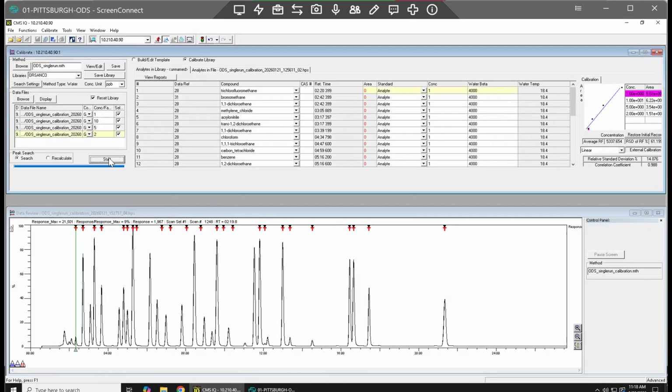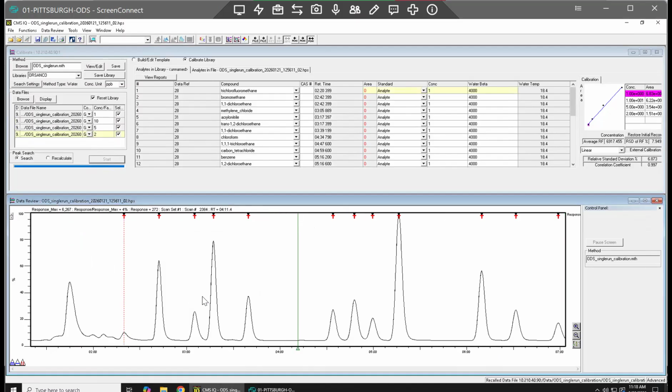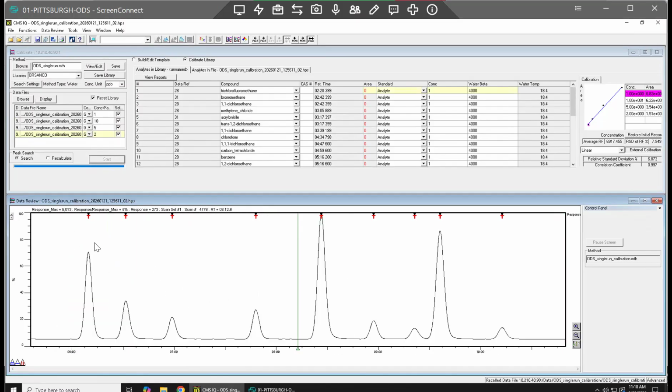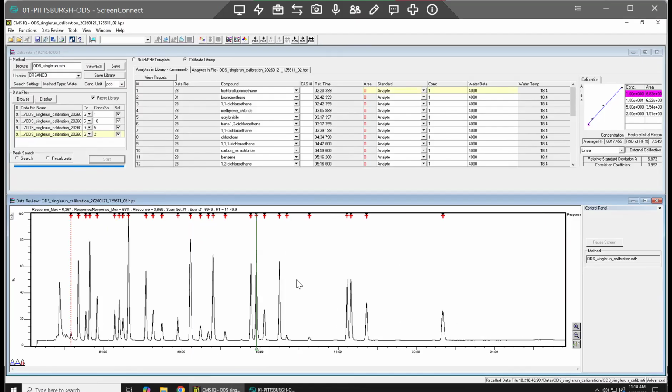And then we should see the crosses all move, hopefully to the right peaks. So let's just look at a few of these and see. Okay, that one lines up. Yes, yes, yes, yes. Okay, good. So it looks like it worked. Double check all of these. Okay, looks good. Peak, peak, peak. Awesome. So I think that's good. That means it took what we just adjusted. So that's phase one, I guess.